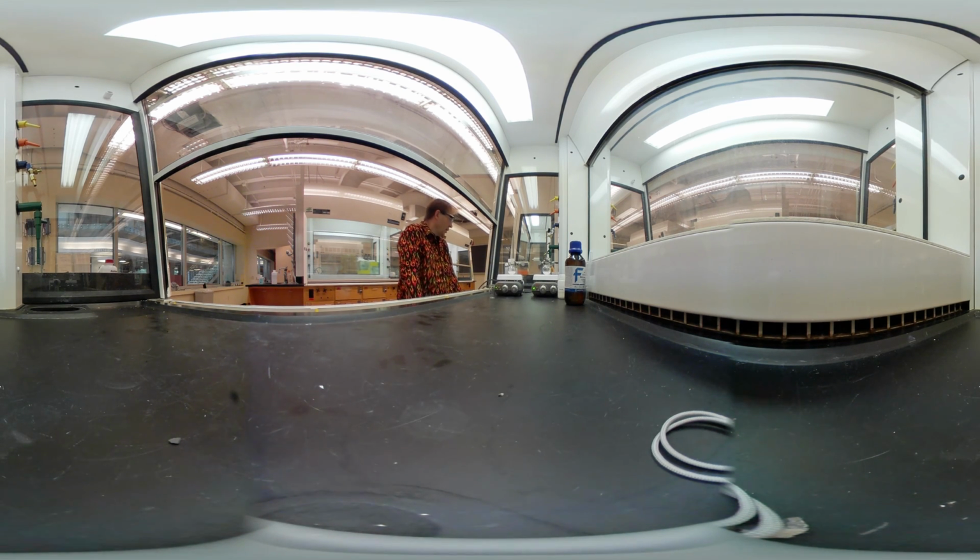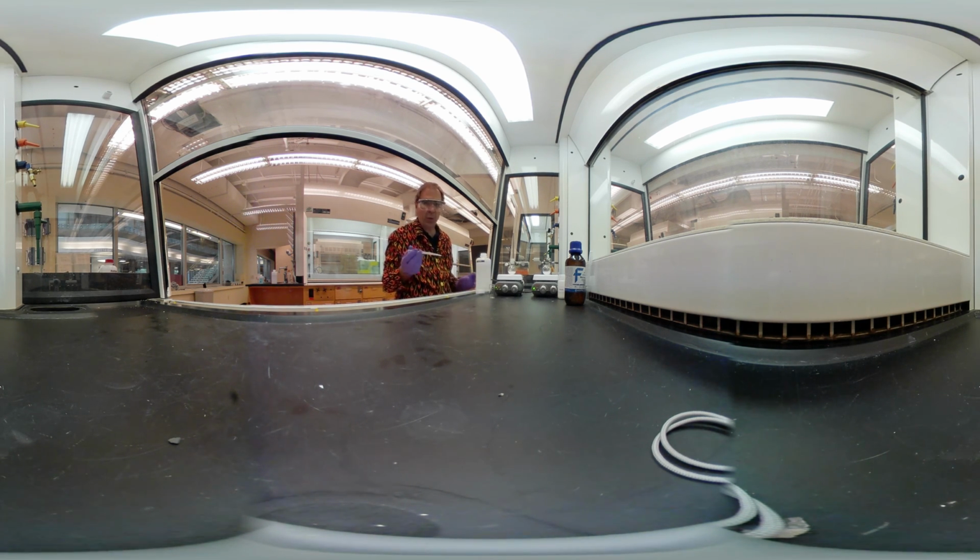Okay. And we're going to add 3 drops of water to this. You need to make sure I'm using deionized water. Just a little bit of water, about 20 drops per milliliter, so the idea is that we're not doing very much here. 3. Whoa, wow, something's happening. Start to get my reaction to go right away.